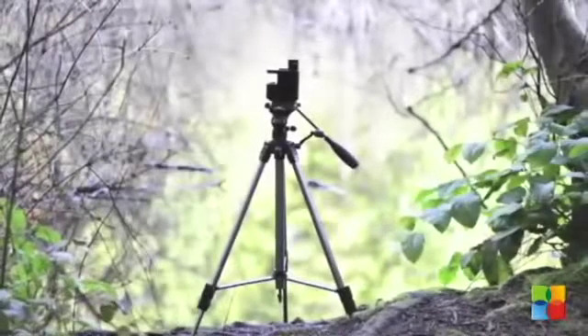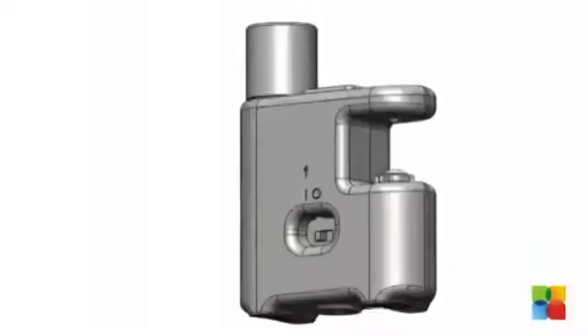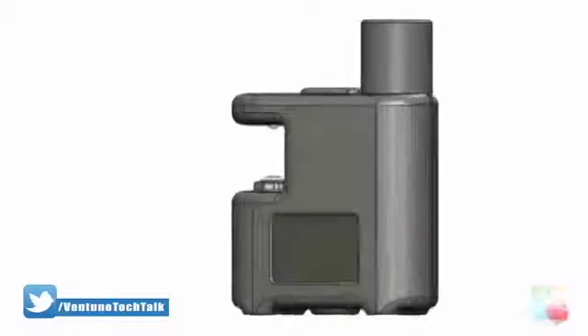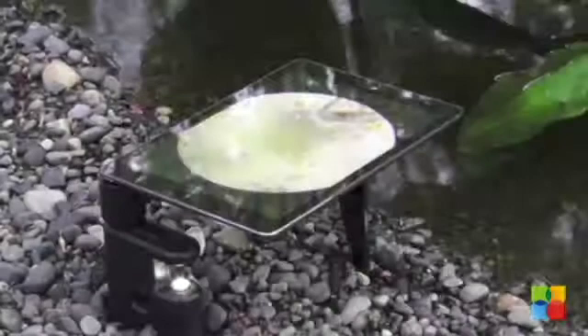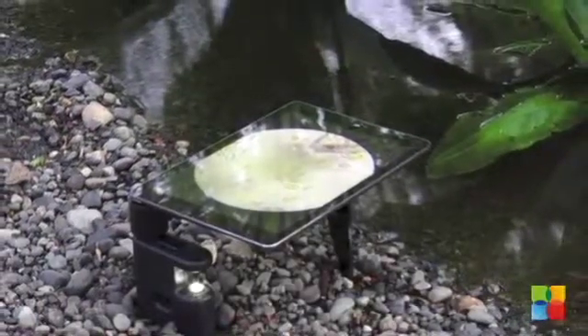It is simple for even a child to use and doesn't require any supplies such as slides and knobs to adjust. Just attach a AAA battery for illumination and you're good to go. The Microbe Scope allows 800x magnification and goes up to 2000x with zoom features of newer iPhones.